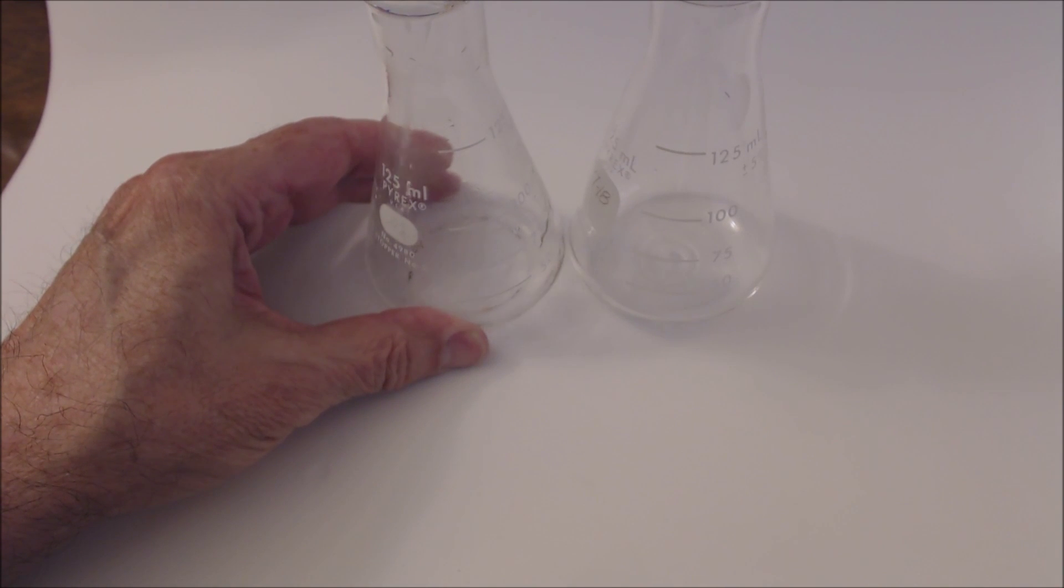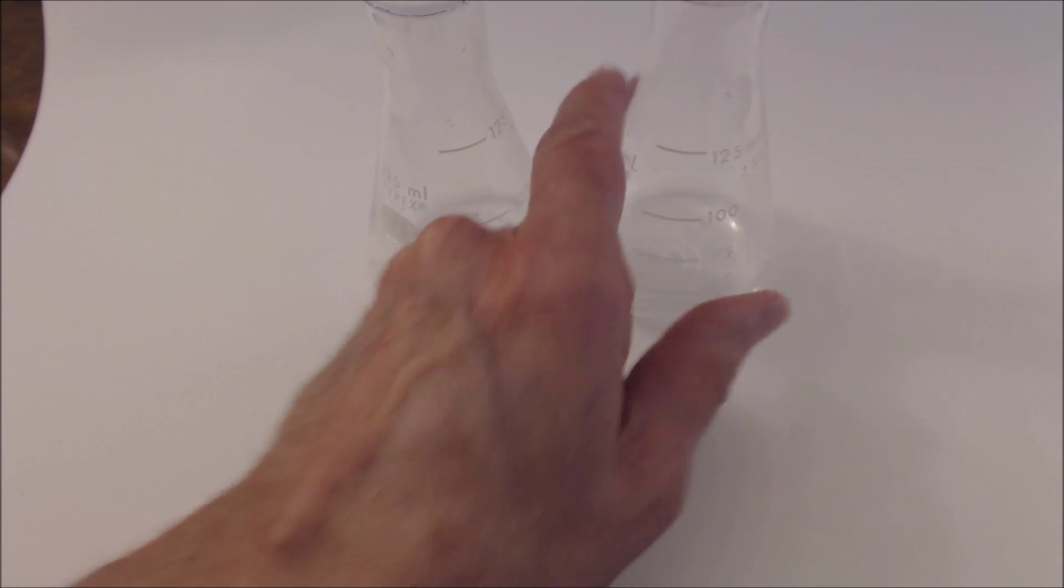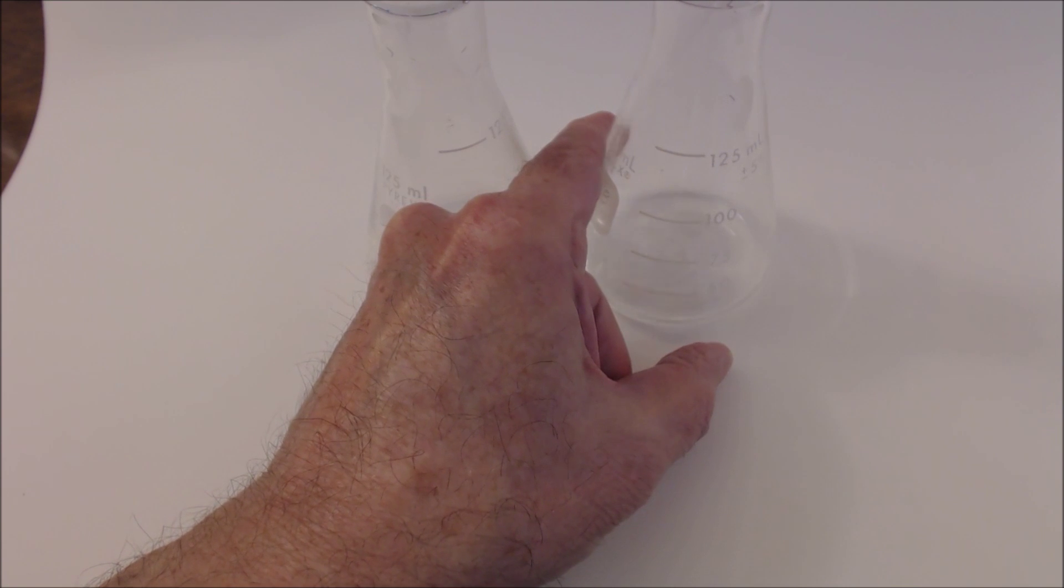I'm going to put about 25 milliliters of acetic acid in two containers, two Erlenmeyer flasks.